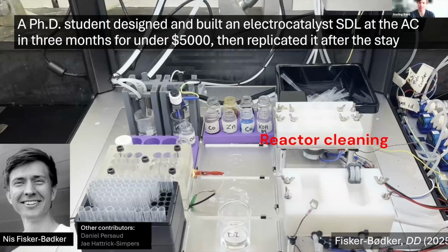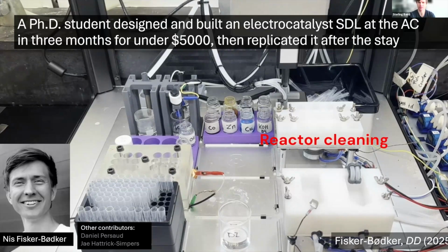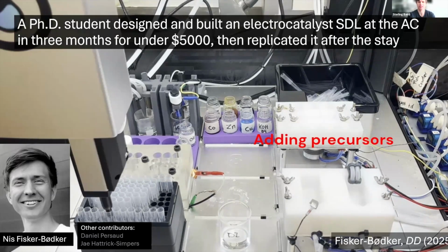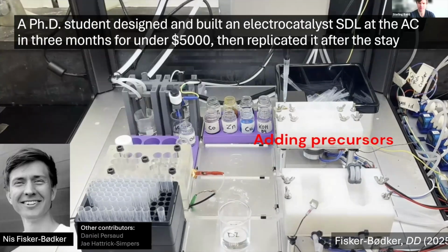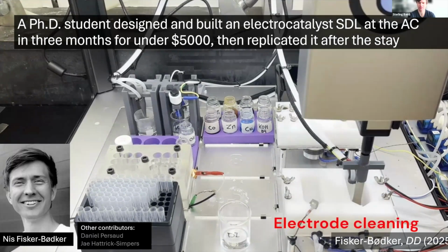And you can see an example of the sophistication of this workflow here. It's reusing a pipette tip to pick up different tooling. It's adding the metal precursors. We'll see it pick up an electrodeposition tool. What's the electrode? Perform the electrodeposition, ultrasonically clean it, and continue and carry this out in a loop.